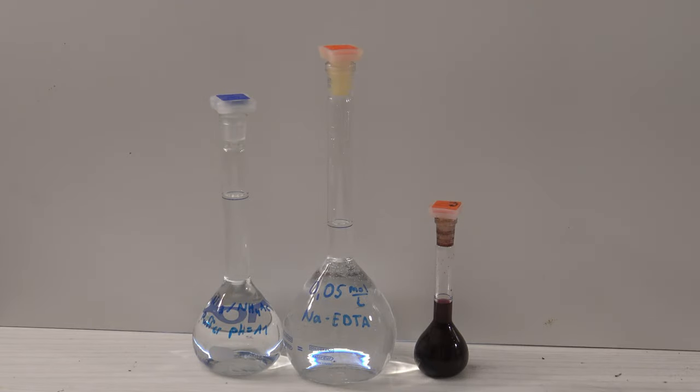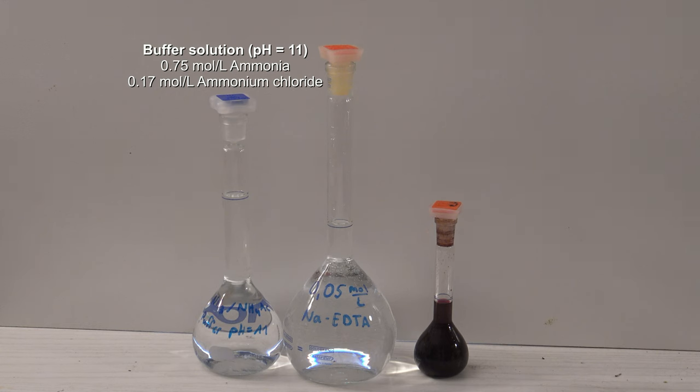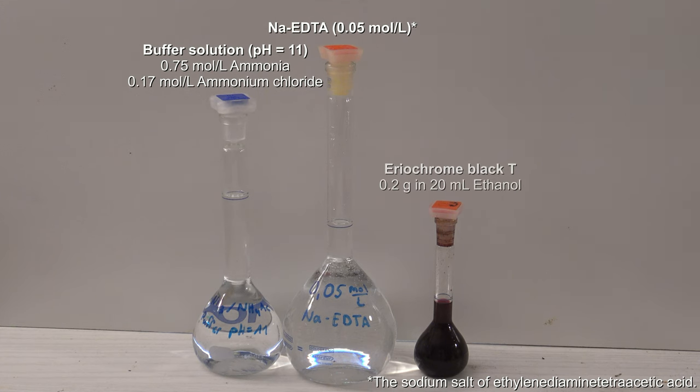Three solutions are needed. A buffer solution with a pH of 11, which is an aqueous solution of ammonia and ammonium chloride. An aqueous solution of sodium EDTA. And a solution of eriochrome black T in ethanol.